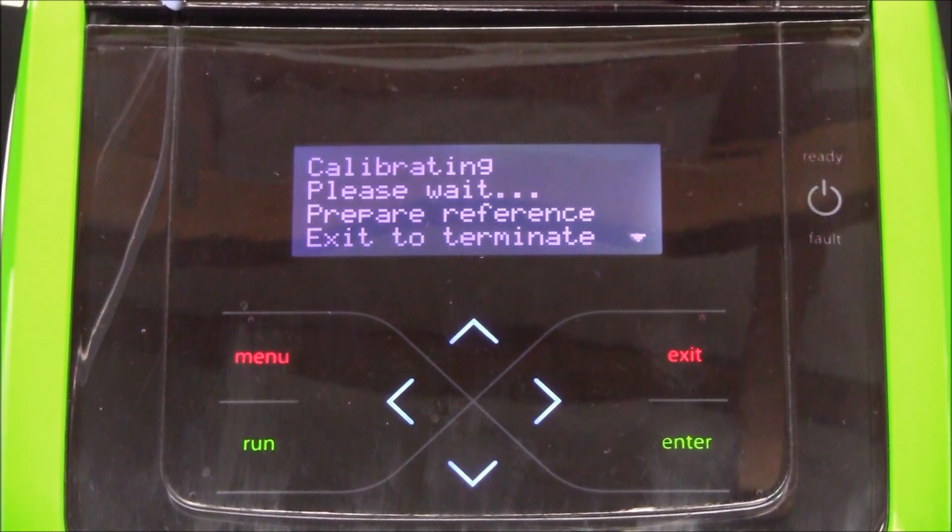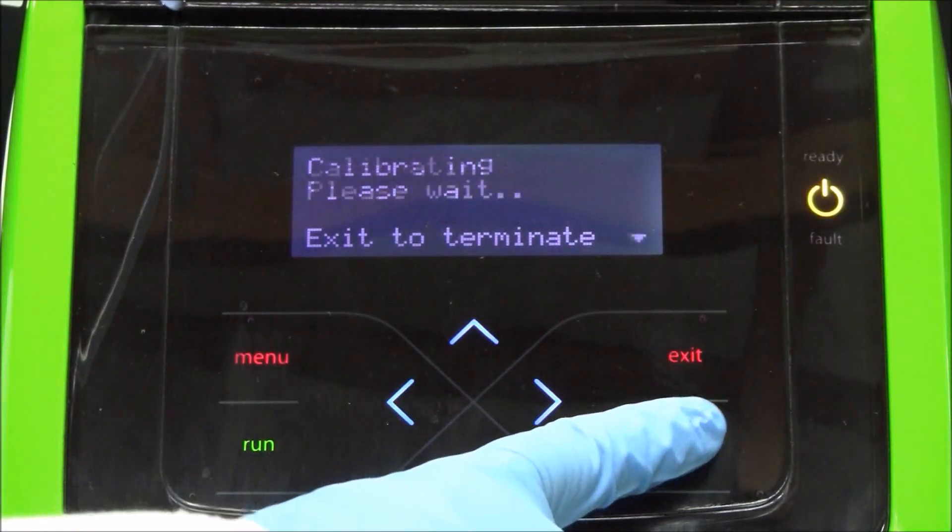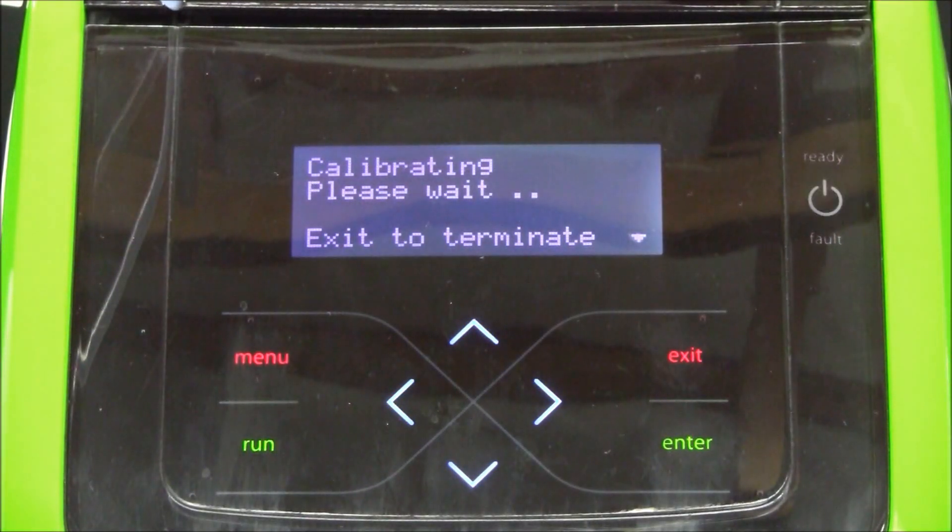Midway through the calibration, the L100 will prompt you to confirm that the reference solution is present. Press enter to continue.